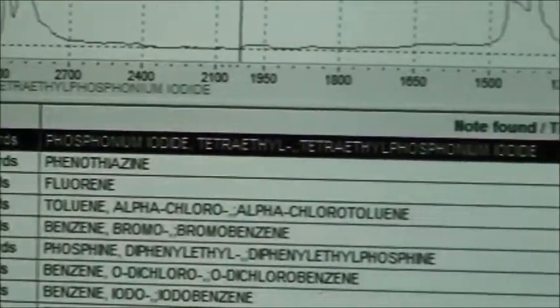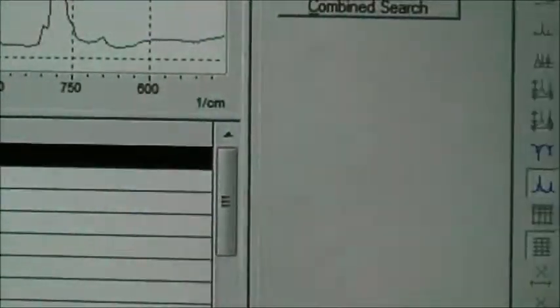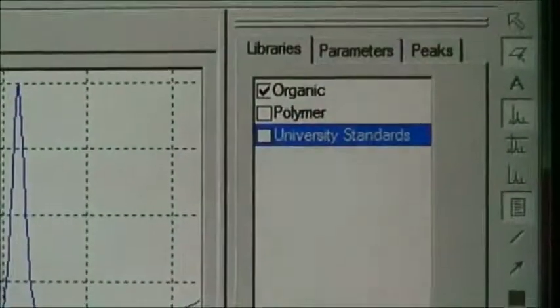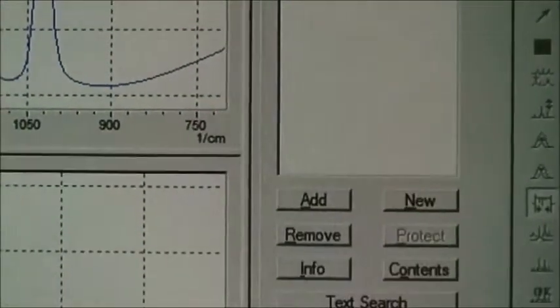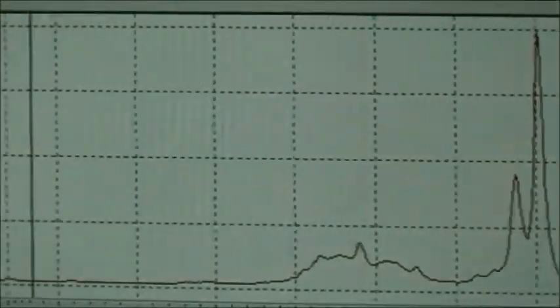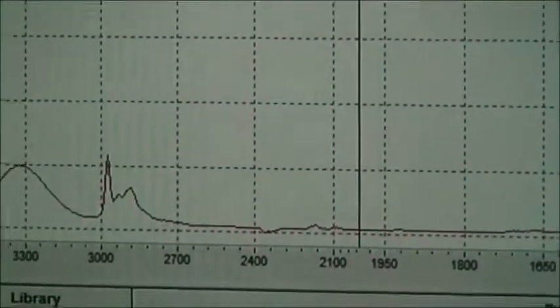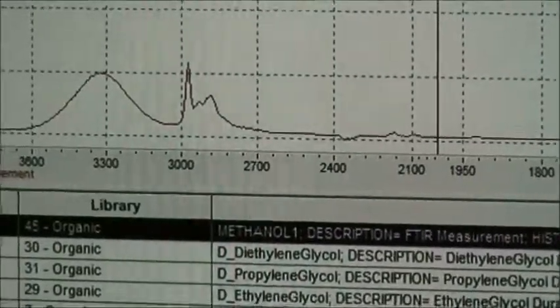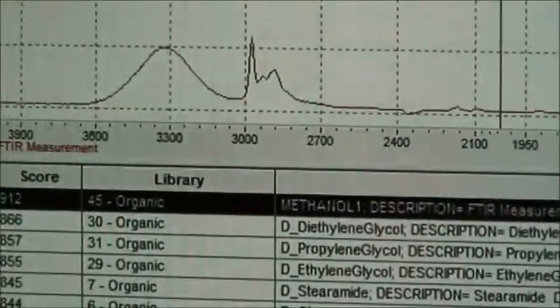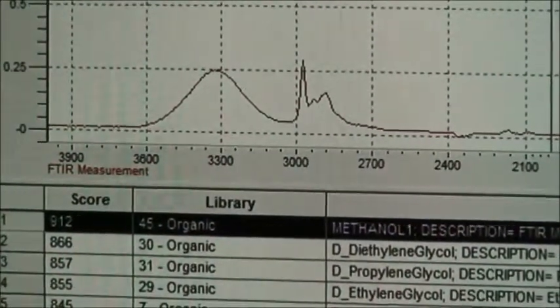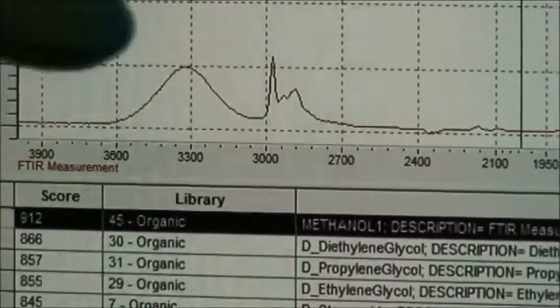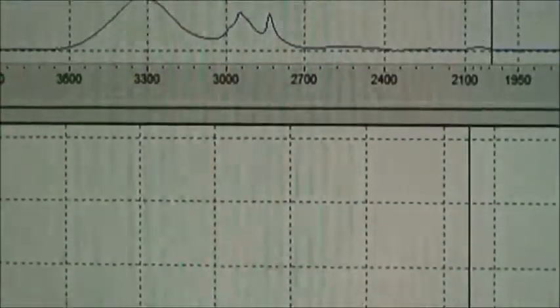So I'm going to click organic libraries. Let's do a spectrum search. Okay. So what did we find this time? The first one on our list with the score of 912 out of 1,000 is methanol. So it shows you our methanol and then it shows you their methanol where they compare the structures.